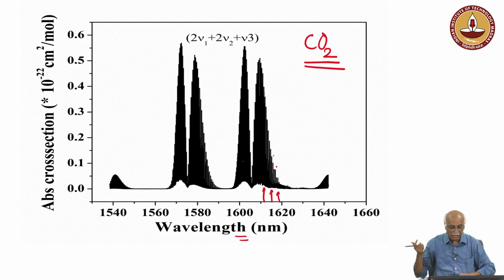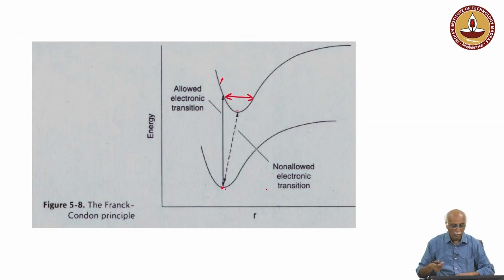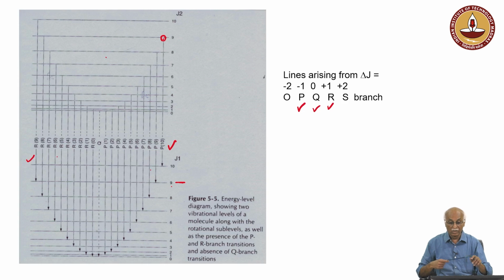So, if I try to see what will happen, all these transitions in terms of ground level returning to the absorption level, or absorption returning to the ground level, will result in various such transitions. Each of these levels will allow corresponding vibrations.